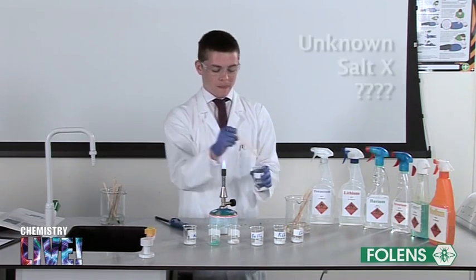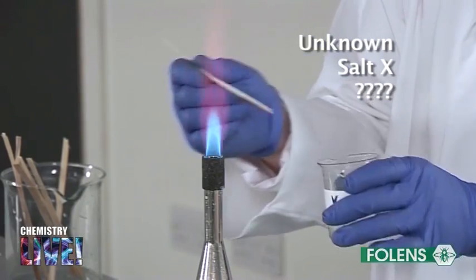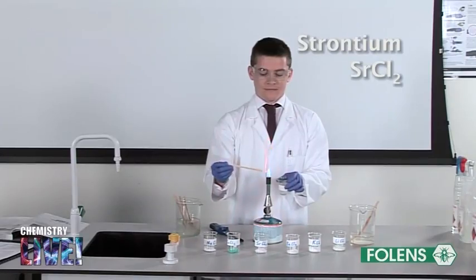Let's now look at our unknown salt. We hold it in the flame, and we see it gives off a red color. Therefore, we can deduce that this salt contains strontium.